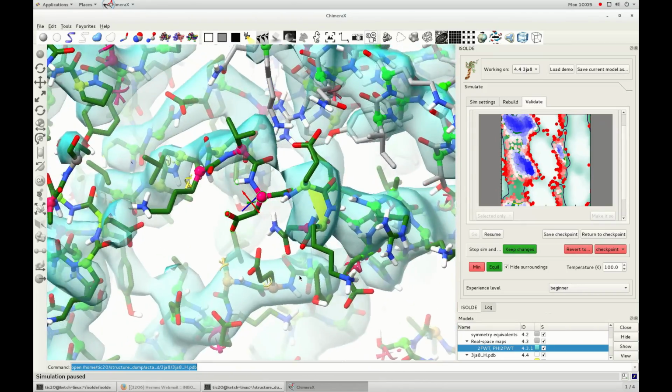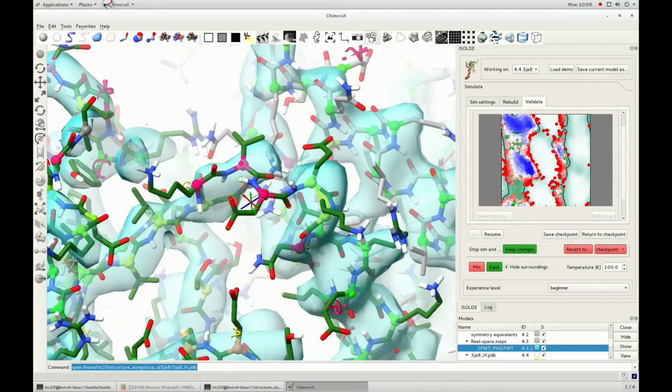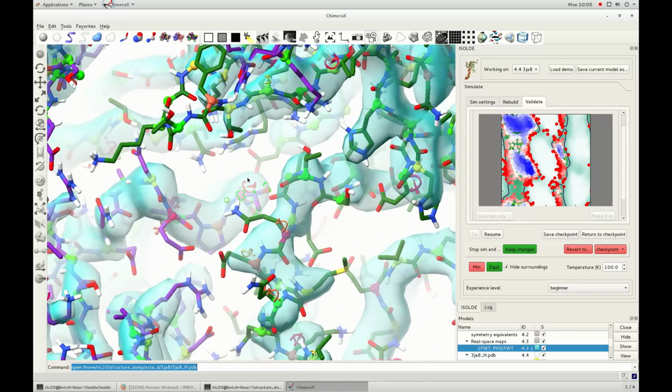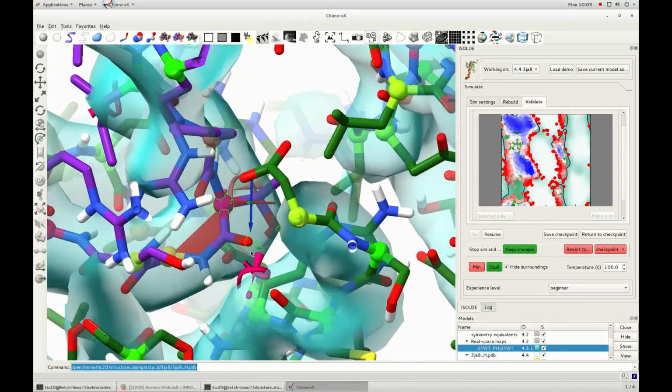While we're looking at the Ramachandran plot, note that clicking on any point in the plot will take you straight to the corresponding residue in the main display. Clicking through a few of the newly introduced outliers, we quickly come across a non-proline cispeptide bond, another red flag.